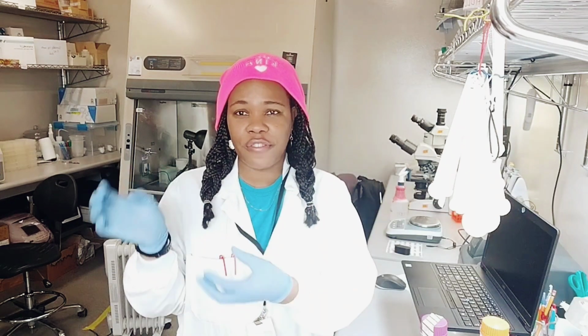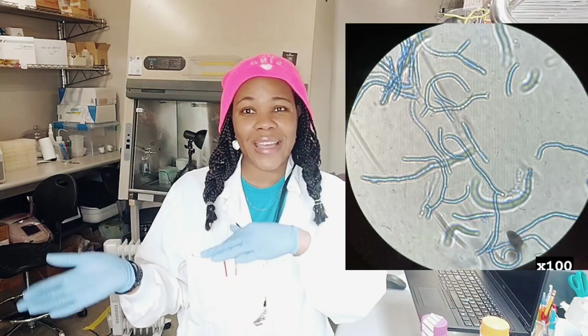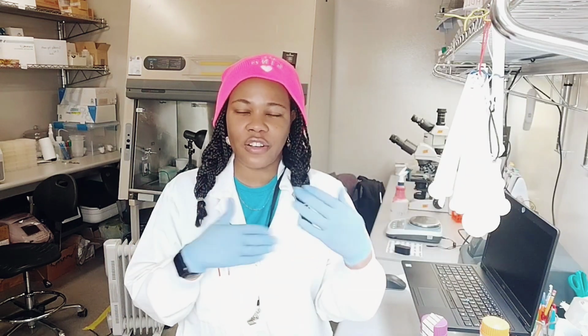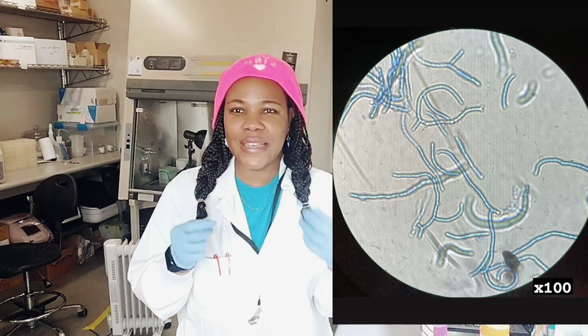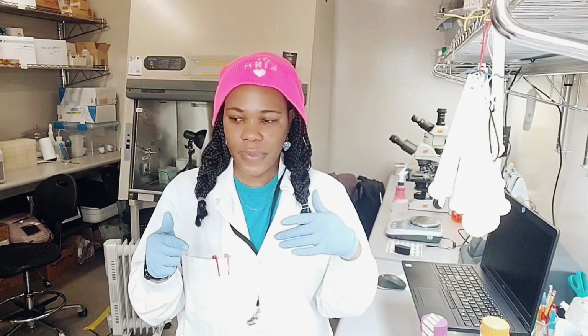As a quality control, I like to stain about 10 or 20 microliters of the inoculum with lactophenol blue. Again, remember that it stains a particular compound, chitin, that's in the fungal cell wall, blue, and that helps to provide contrast, because if not, they'll just look like little water things swimming, but it gives it a blue tint. And again, chitin is one way of distinguishing bacteria from fungus.